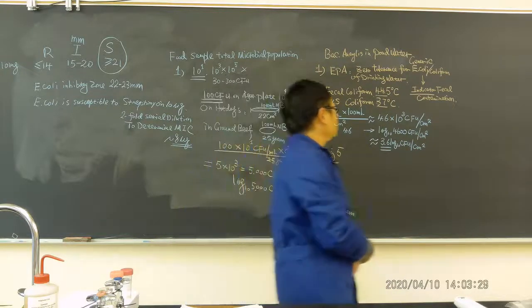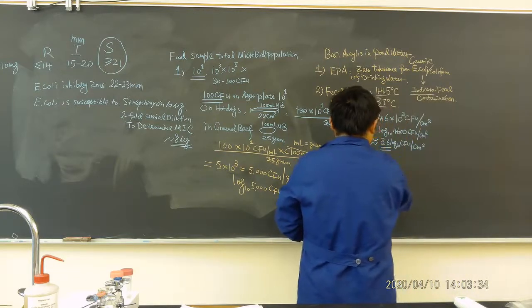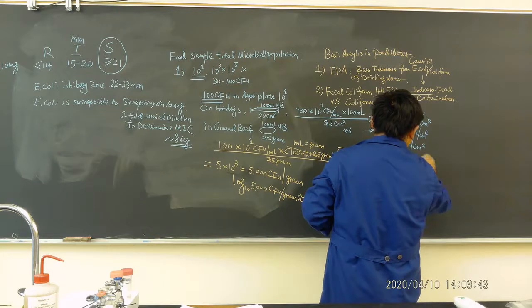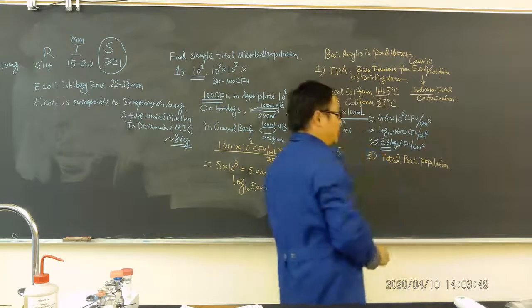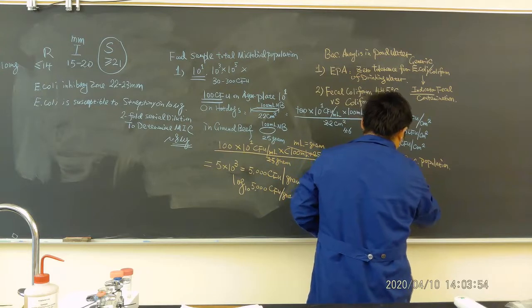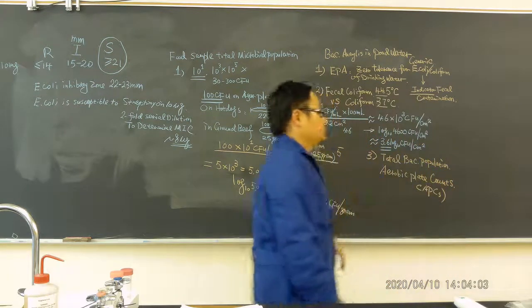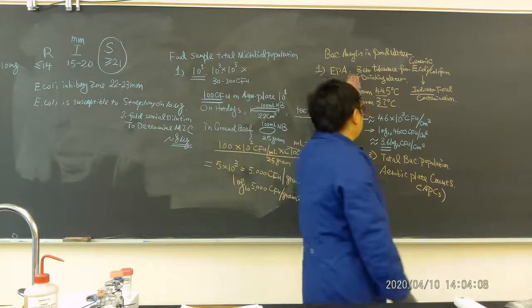Okay? Now the third thing I also want to mention is that sometimes we also test the total microbial population, like we did in the food sample. It's called the total bacterial population. What we really do is use aerobic plate counts, called APCs. This is also an indication of how large the population is in the water. Okay, so these are things I want to mention.